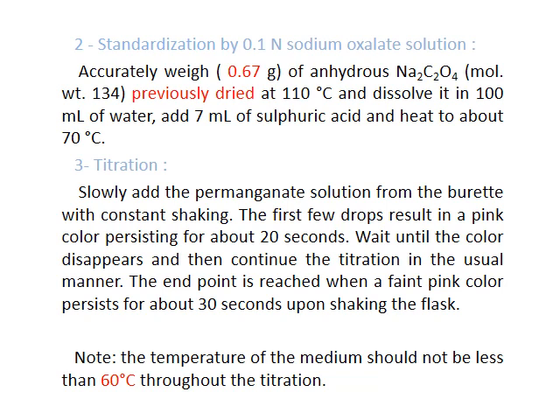Standardization by 0.1 normal sodium oxalate solution. Accurately weigh 0.67 grams of anhydrous sodium oxalate previously dried at 110 degrees centigrade and dissolve it in 100 milliliters of water. Add 7 milliliters of sulphuric acid and heat to about 70 degrees centigrade.